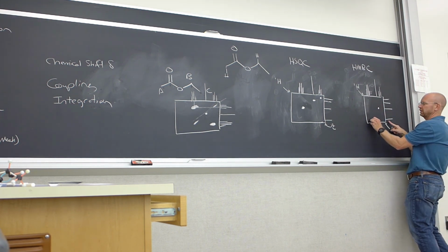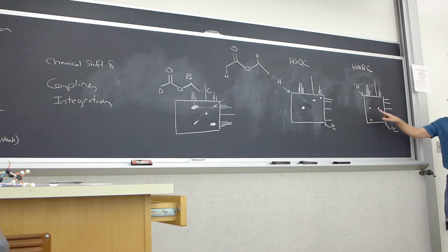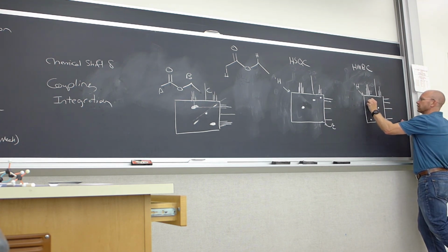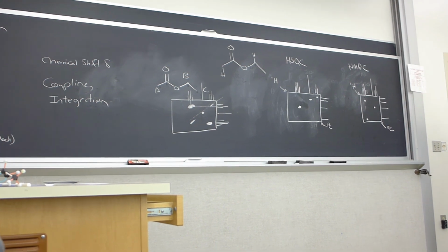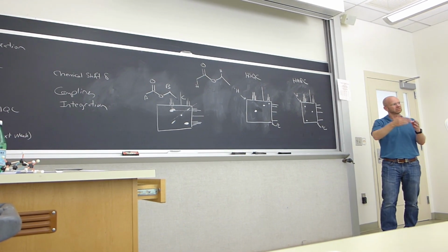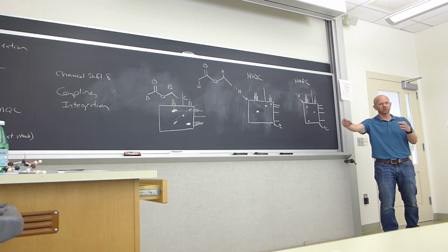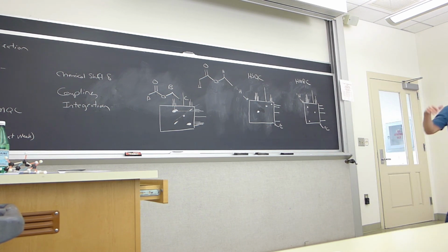One with the carbonyl peak, and one with this one, the one that's next to the carbonyl. Does everyone see what I'm talking about? So that's a 3 or a 4 bond coupling. You can actually look some distance away in the molecule from one proton, and you can set how many bonds away you want to look. Typically it's 3 or 4 bonds. All right, that's all I'm going to talk about today.